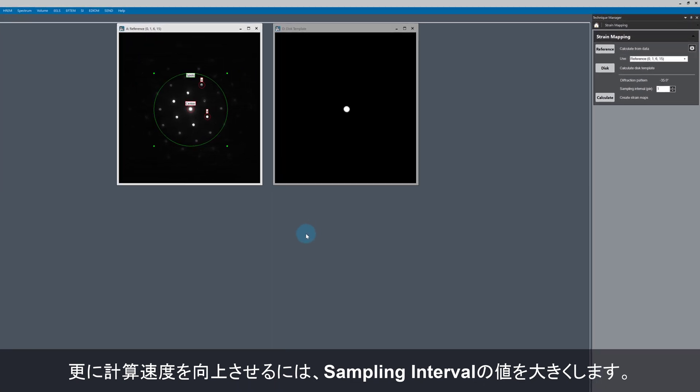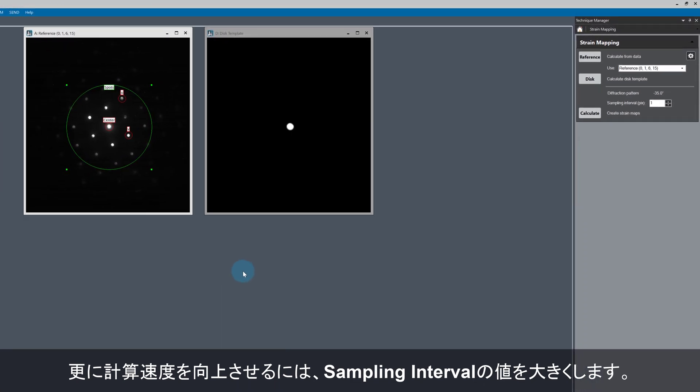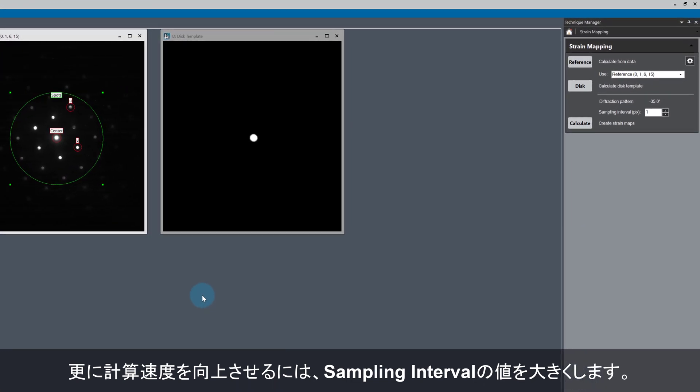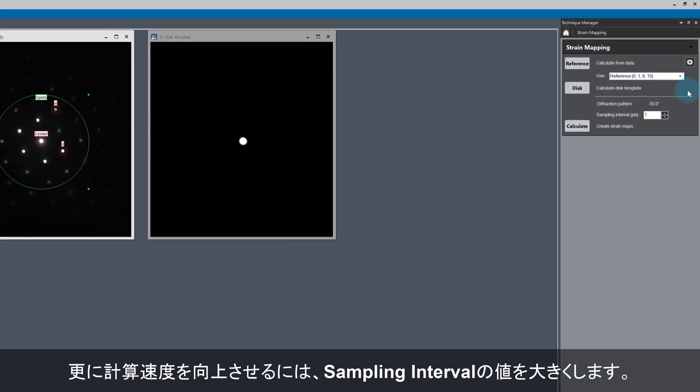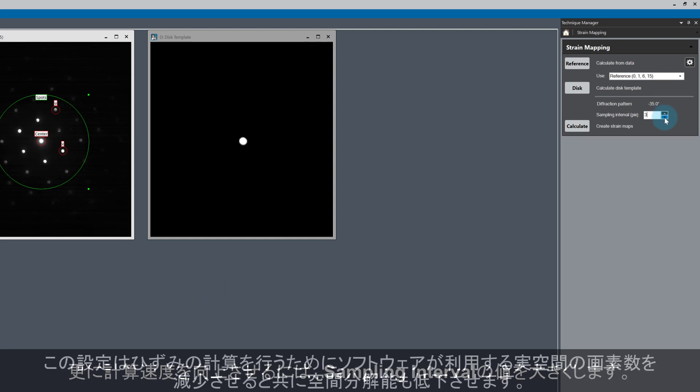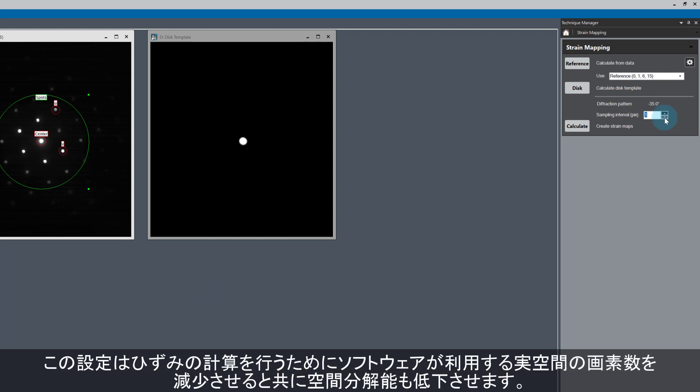The calculation time can also be reduced by increasing the sampling interval from 1 to a larger value. The number of pixels in real space will be skipped and you'll get strain maps quicker, but the compromise is a reduction in spatial resolution.